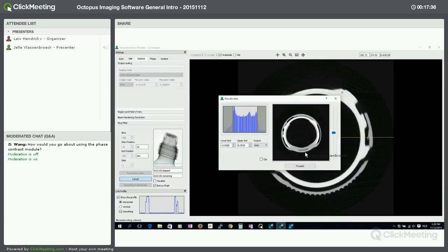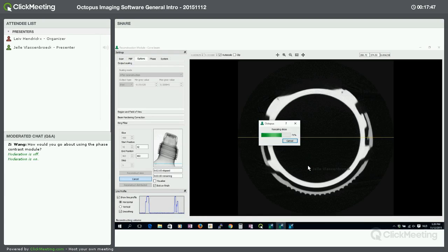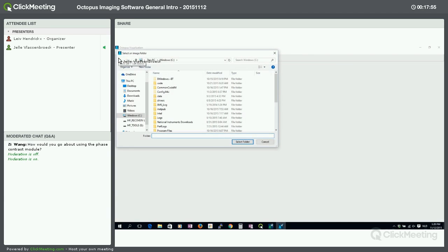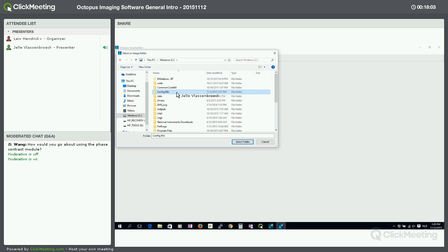So I think maybe it's one more thing to do. I still have to scale the volume correctly. This is something you can do after reconstruction, but also beforehand. I will do it now. The scaling module is just to make sure that all the images have the same grayscale level. Otherwise, if you load them in visualization, there would be different gray values depending on the height. So I will take a look at the results in our visualization program.